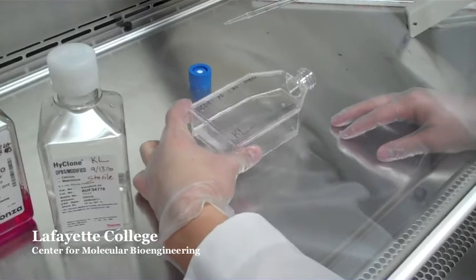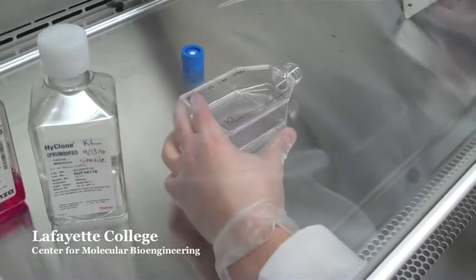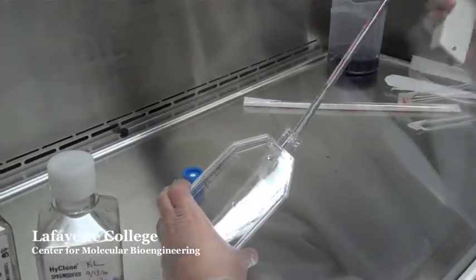After letting the PBS sit in the flask for a minute or two, swirl it around to make sure the entire flask is covered. Then aspirate the PBS and discard it into the waste beaker.